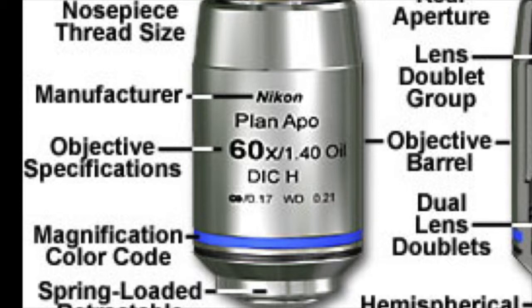Now you're going to be working with a 20x objective. You're going to be working with a 20x wet objective. So we'll have to talk about oil immersion and other immersion. You'll be working with a 63x, again, wet objective. And you'll understand what I mean by wet in a few minutes. And also a 100x wet objective.